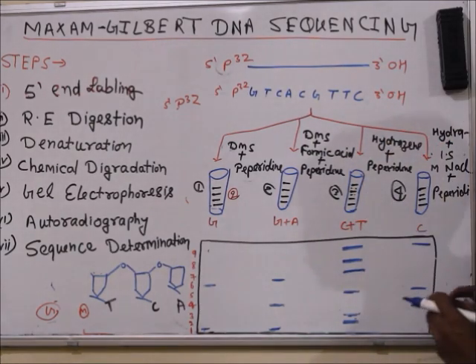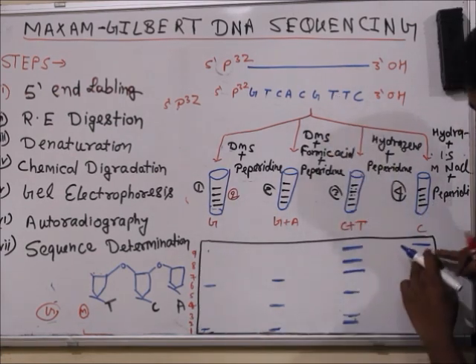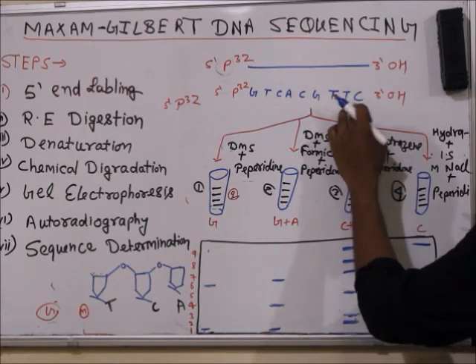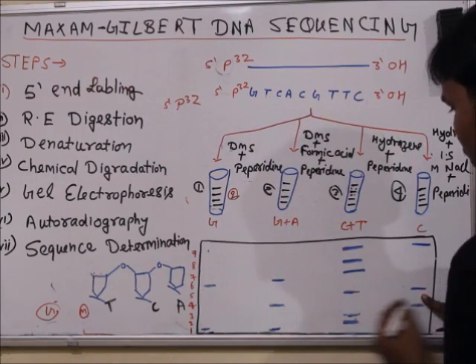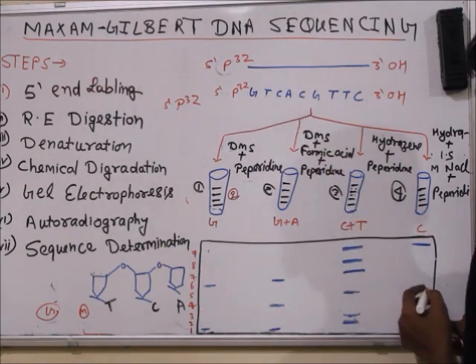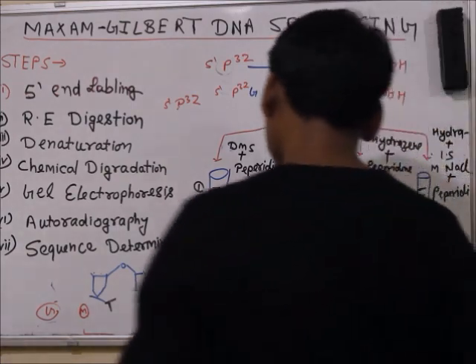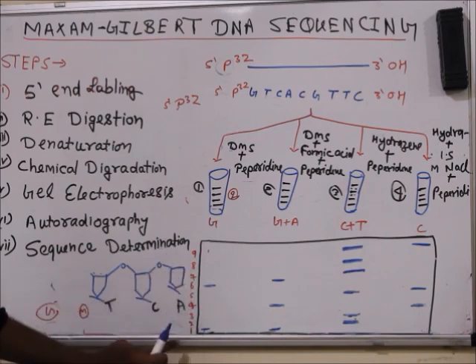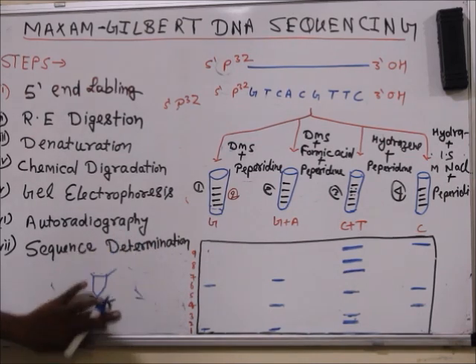In the case of cytosines, you can easily understand that in the 9th position there is C. And in the positions you will see 1, 2, 3, that is in the 3 positions. In the 3 positions there is this, and 1, 2, 3, 4, 5, in the 5th position, that is C. The bands were showing the number of nucleotides after digestion in the separate gel.